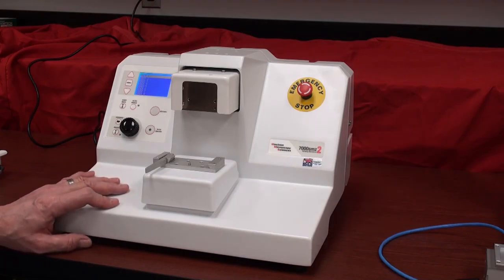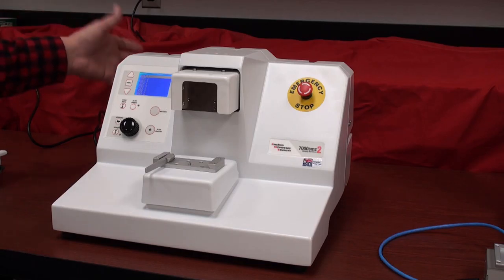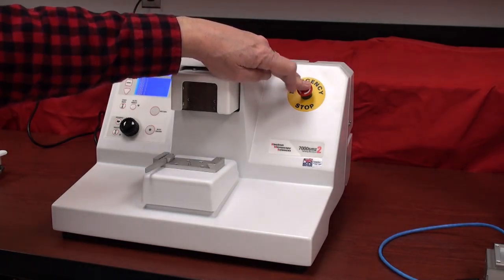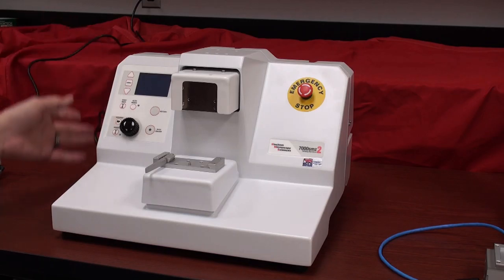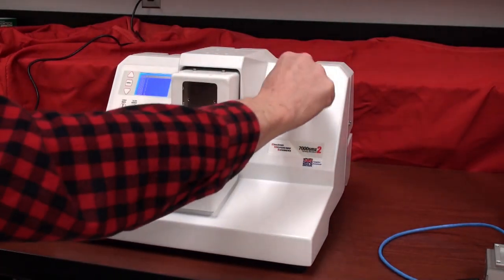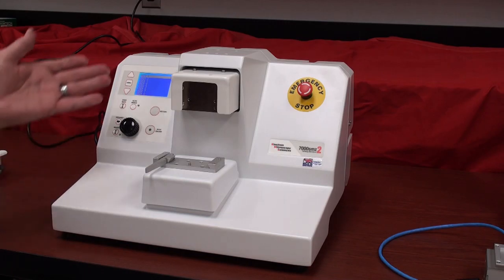On the front side of the unit, I've now plugged the system in and powered the instrument up. Another important thing to recognize is there's an emergency stop button. Sometimes in shipping that gets depressed and the instrument, even though you flip the switch in the back, will not come on. To reset it, you just rotate the red outer knob of the emergency stop switch and the instrument powers up.